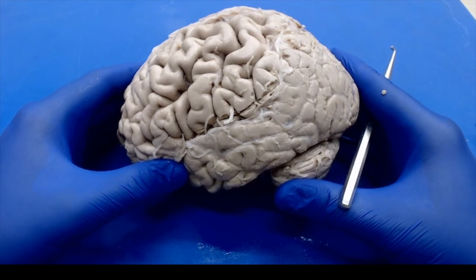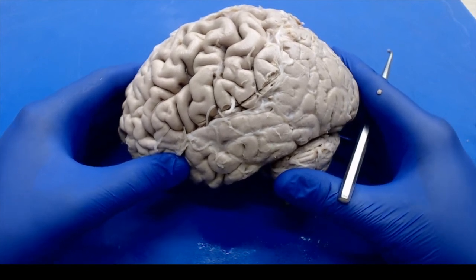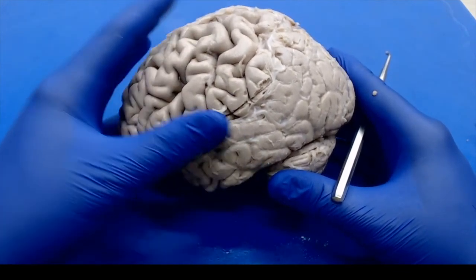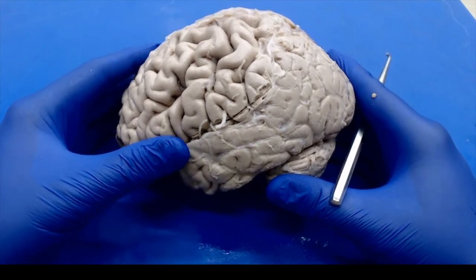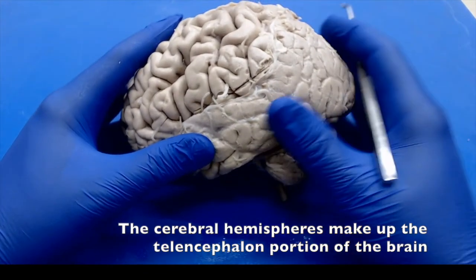You will go into more detail about neuroanatomy when you get into neuroscience, but that won't stop us from going over and appreciating some of the basic structures of the brain. When you first look at the brain, you notice it's got that characteristic folded-in-on-itself appearance. You learned that word as cerebriform, taken from the cerebrum. You've got your two main components, the cerebrum and the cerebellum, that you can usually easily identify.